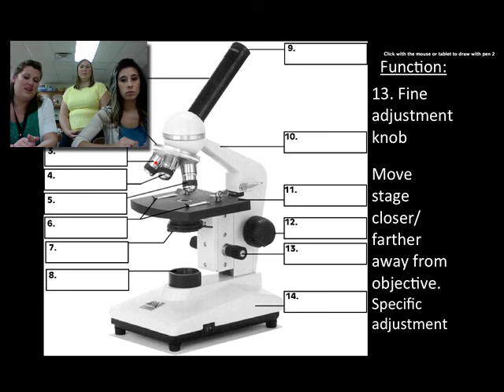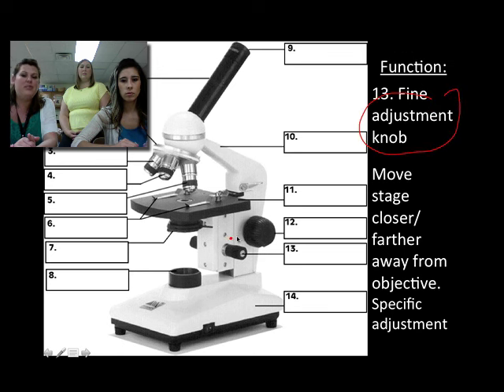Next we have the fine adjustment knob. It's the lower and smaller adjustment knob on your microscope. It moves the stage closer and farther from the objective, but with specific adjustment. You have to be very careful when using the coarse adjustment at higher magnifications. You must use the fine adjustment knob or you will break a slide.